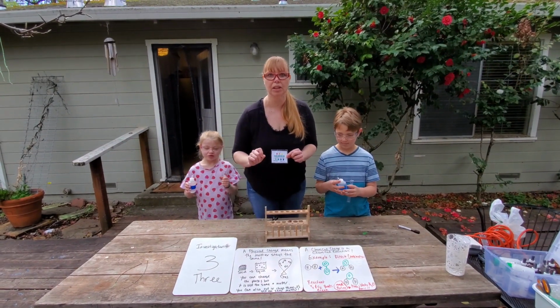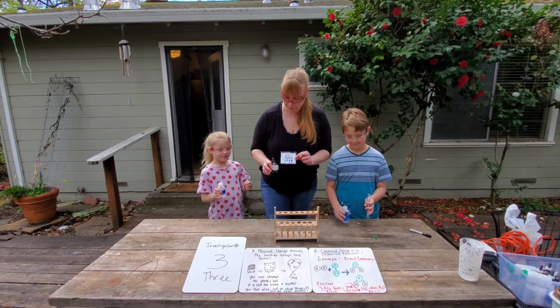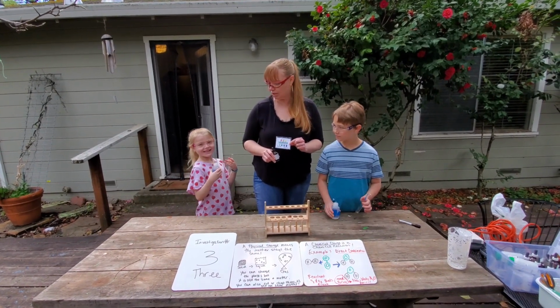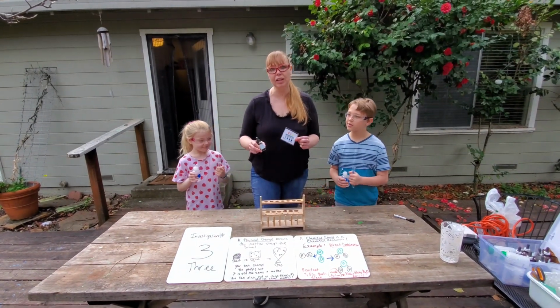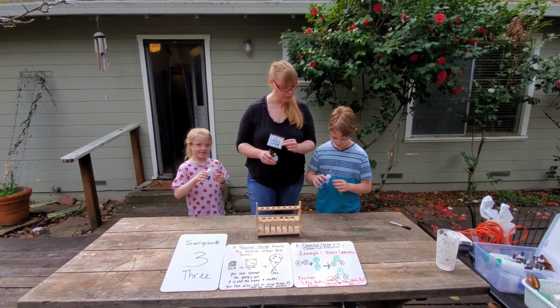Investigation number 3. Is it a physical change or a chemical change? Remember, qualitative data here, please, people. So Jewel has vinegar. She's going to put 10 drops of vinegar into the test tube, please, Jewel. Troy has ammonia, which is basically Windex cleaning. And so he's going to put 10 drops of Windex ammonia into his test tube right now.